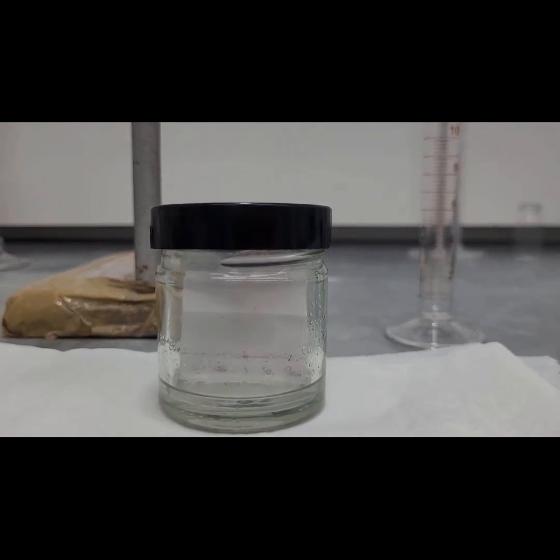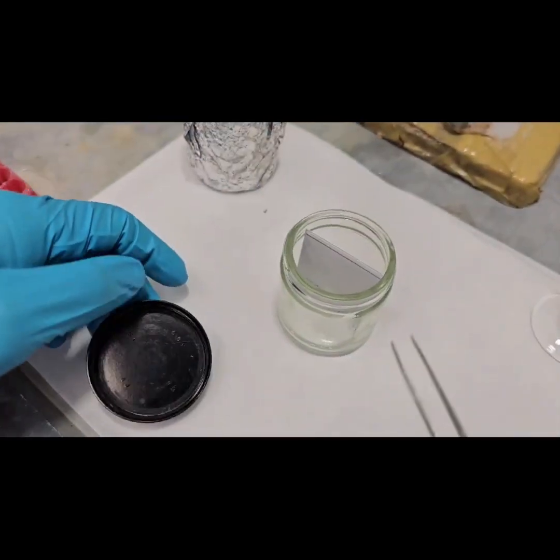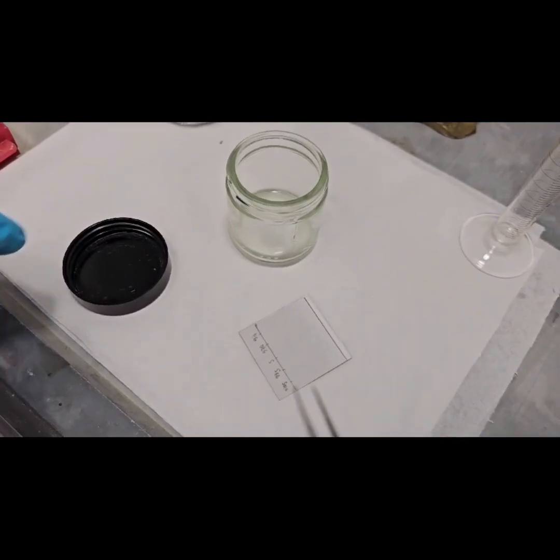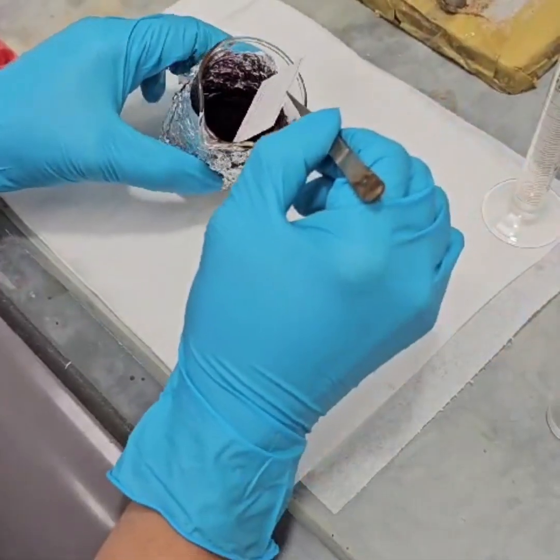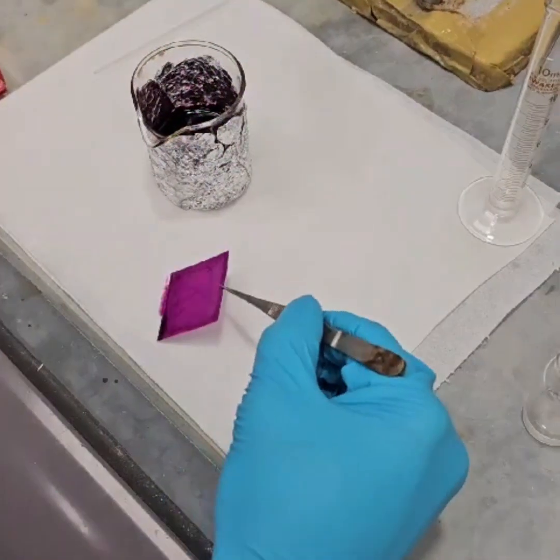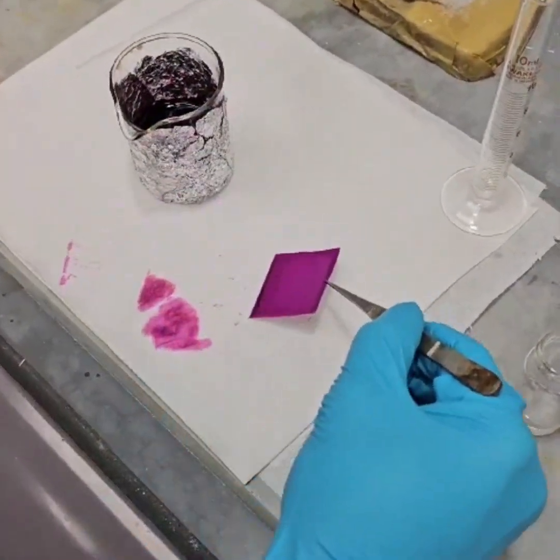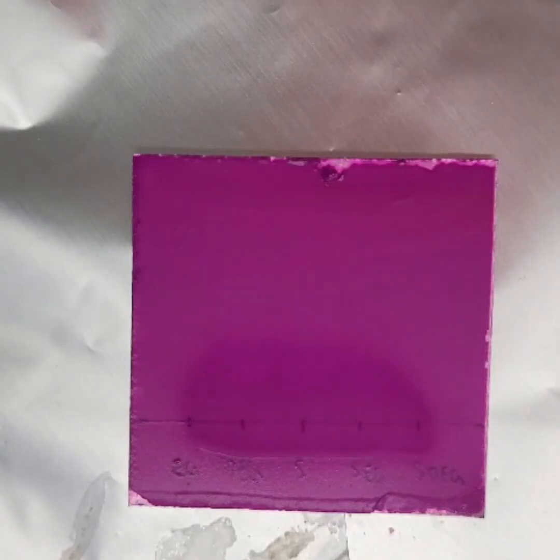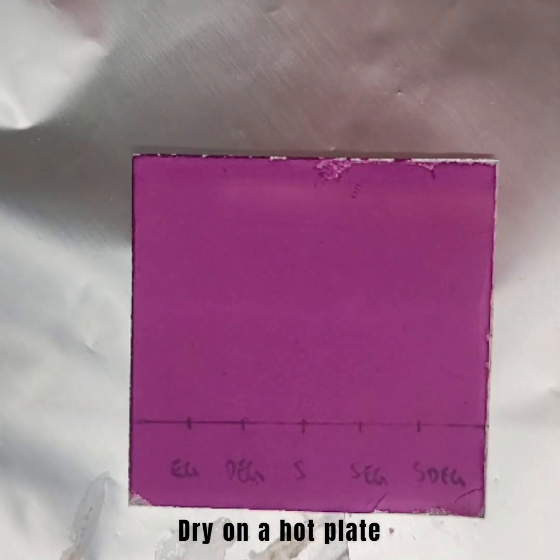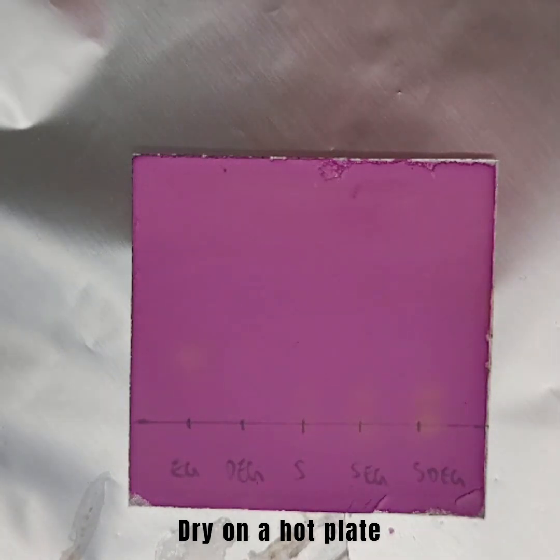Once the solvent has reached the top, cautiously remove the TLC plate and dip it into the staining solution after partial drying in the air. Ensure that the complete plate is submerged. To visualize the samples that are on the TLC plate, simply place the TLC plate on a hot plate for drying, and in a few minutes, you will observe that the plate is dried completely. This should reveal the different components that are present in our samples.